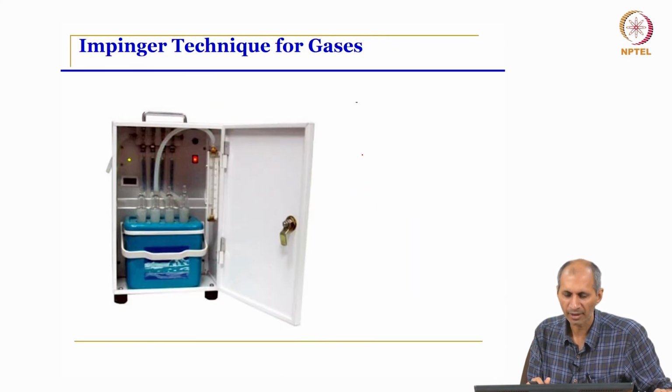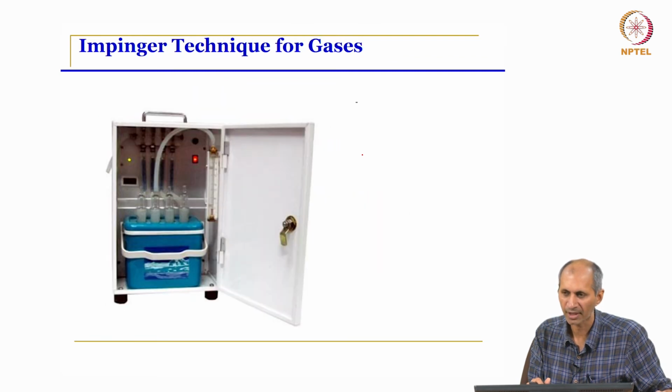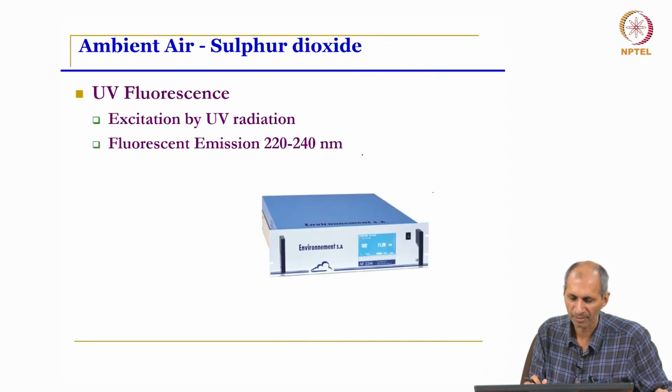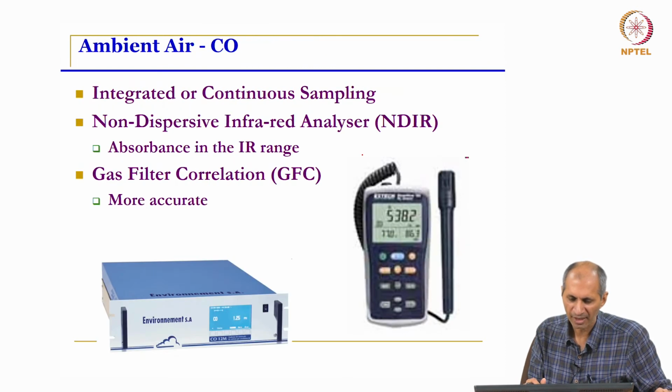Normally the technique that is used for the priority gases SO2, NO2, you can impinge it, collect it in a solution and measure it. There is a chemical method for doing it, it is all there in the standard methods. The other option is you have some equipment which does that. There are equipments which use UV fluorescence and things like that. So it is all there, just go and read it.